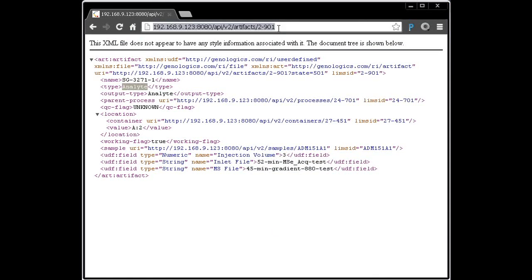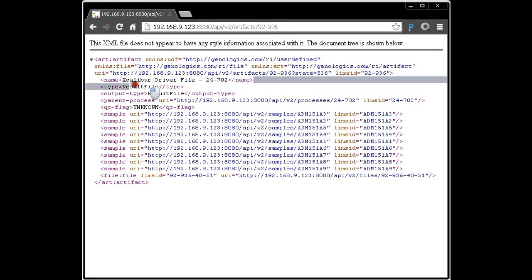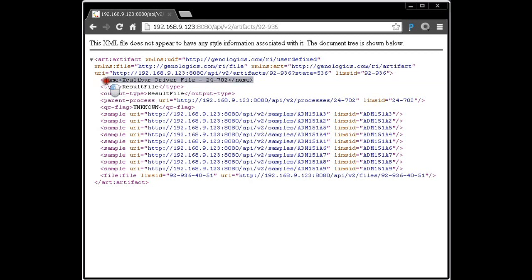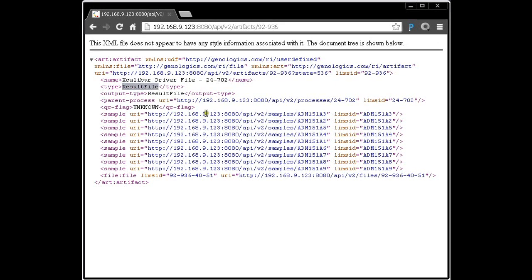We're already looking at artifacts, and as I say, a result file is just an artifact. We can just type in its LIMS ID. Now we see the name of it matches what we have in the LIMS, Excalibur driver file. We see that this type of artifact is a result file rather than an analyte. And we see, since this is a shared result file, i.e. it's associated with multiple things, we see the multiple things that it is attached to.